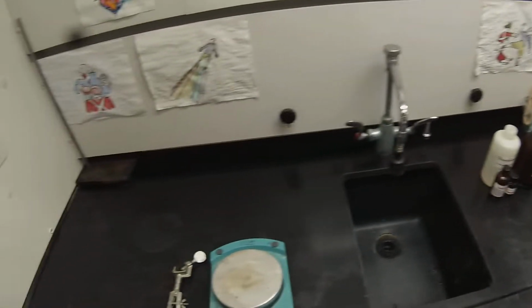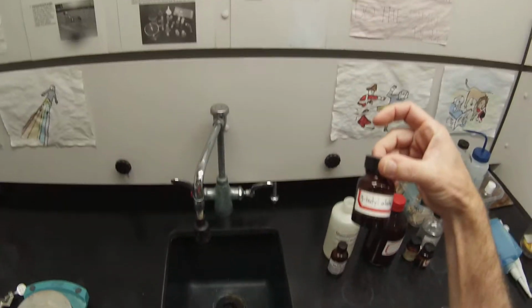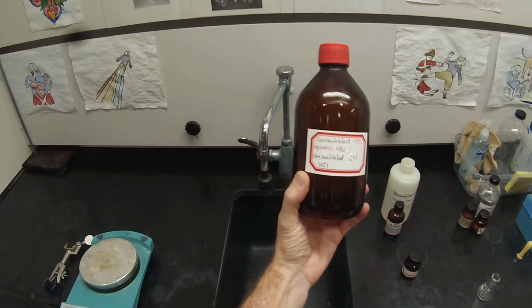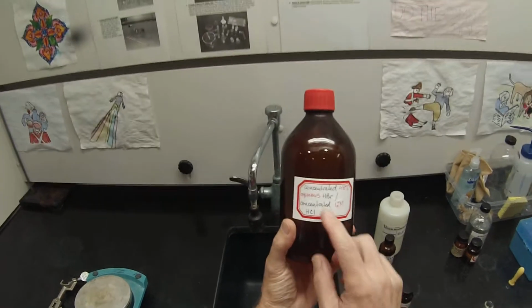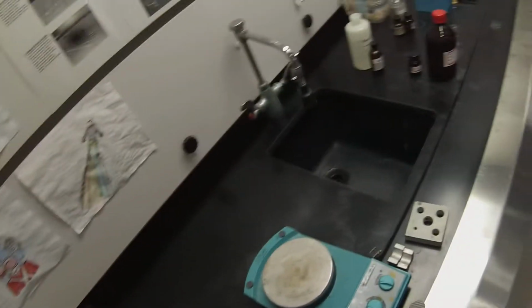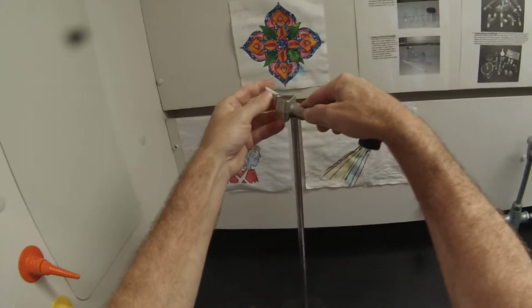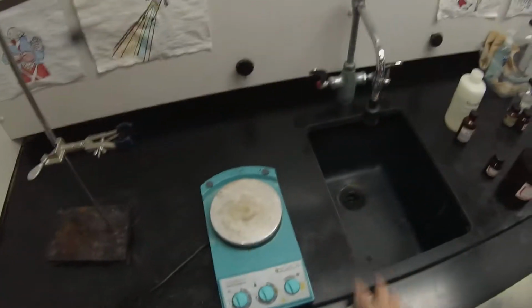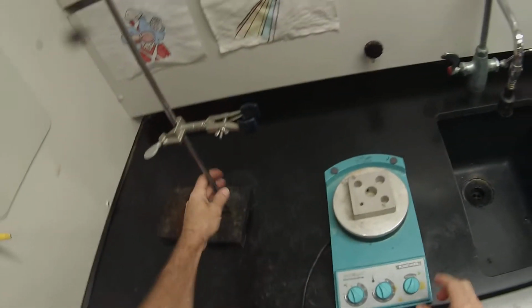So today we're going to set up the reaction of n-butyl alcohol with our mixture of concentrated aqueous HBr and aqueous HCl, which is 48% aqueous HBr and 37% aqueous HCl. So I've already fetched a clamp from the clamp drawer, and I've already pulled out the stirring hot plate that we're going to need, along with the aluminum block and auxiliary blocks that we're going to use to heat our conical vial. So I'll plug that in and make sure it's working and turned off.